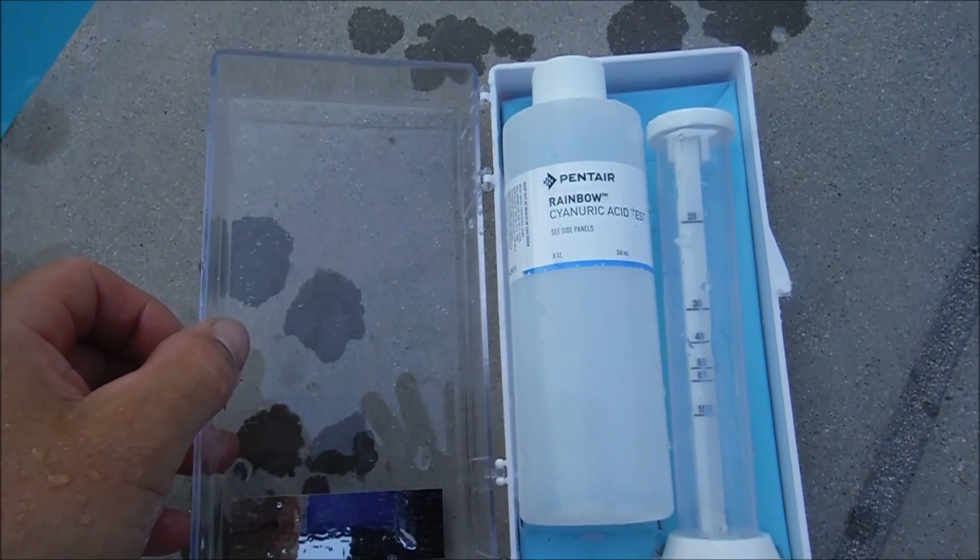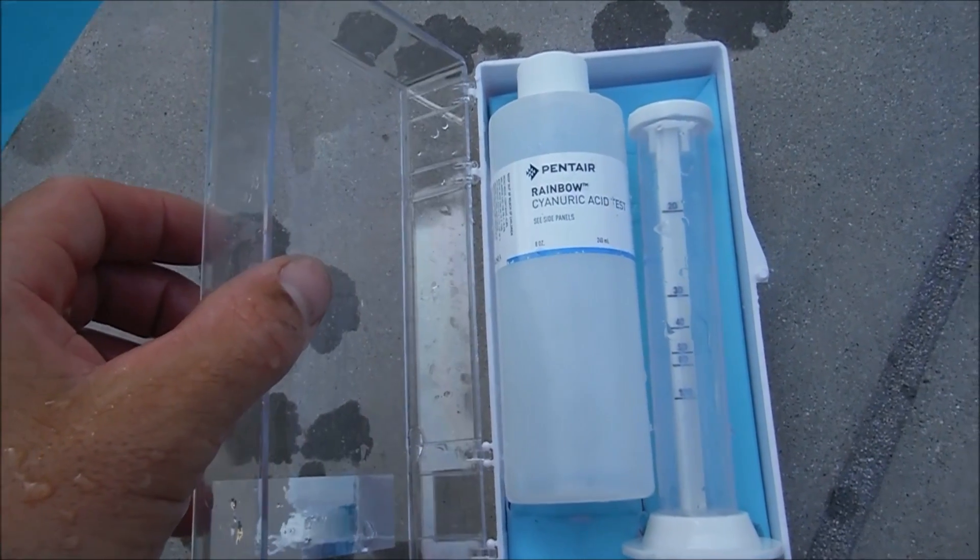This is a great cyanuric acid test kit to get. Very easy to use. Very easy to read your cyanuric acid level.